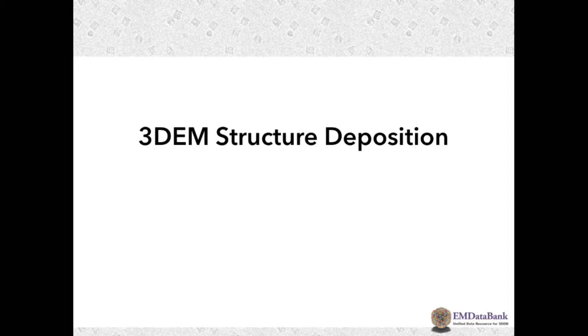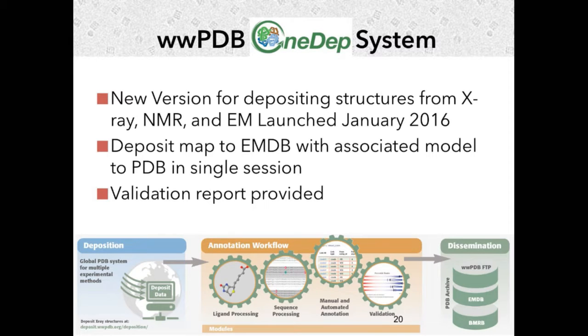And then the last thing I wanted to cover was deposition. Some of you may be doing structure determinations, so I'll give you a little overview of how you actually go about depositing structures into EMDB and PDB. It's actually really nice now, at least that's my impression.